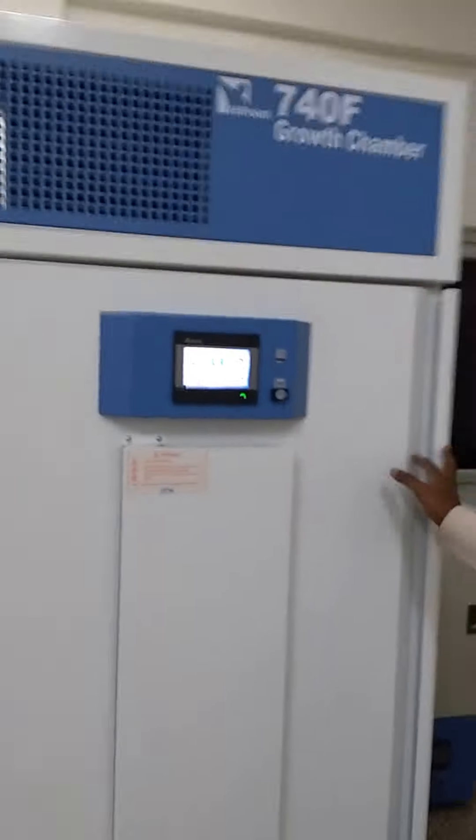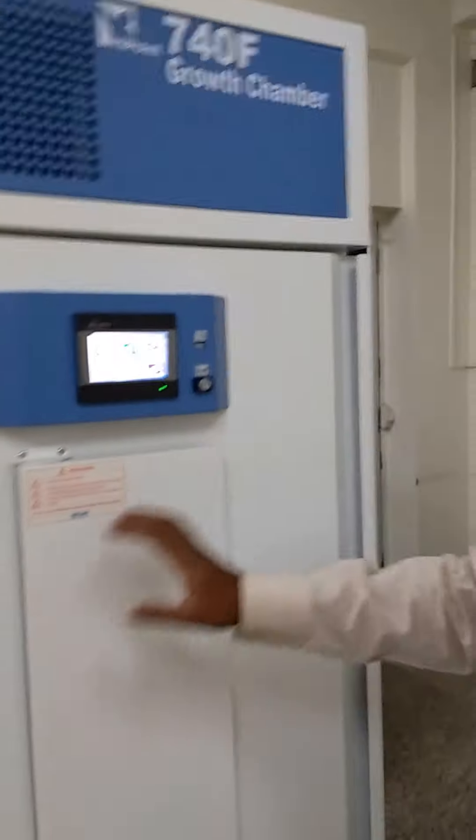Coming to air nets, it has two air nets on either side. One is below the growth chamber and the other is above the growth chamber.